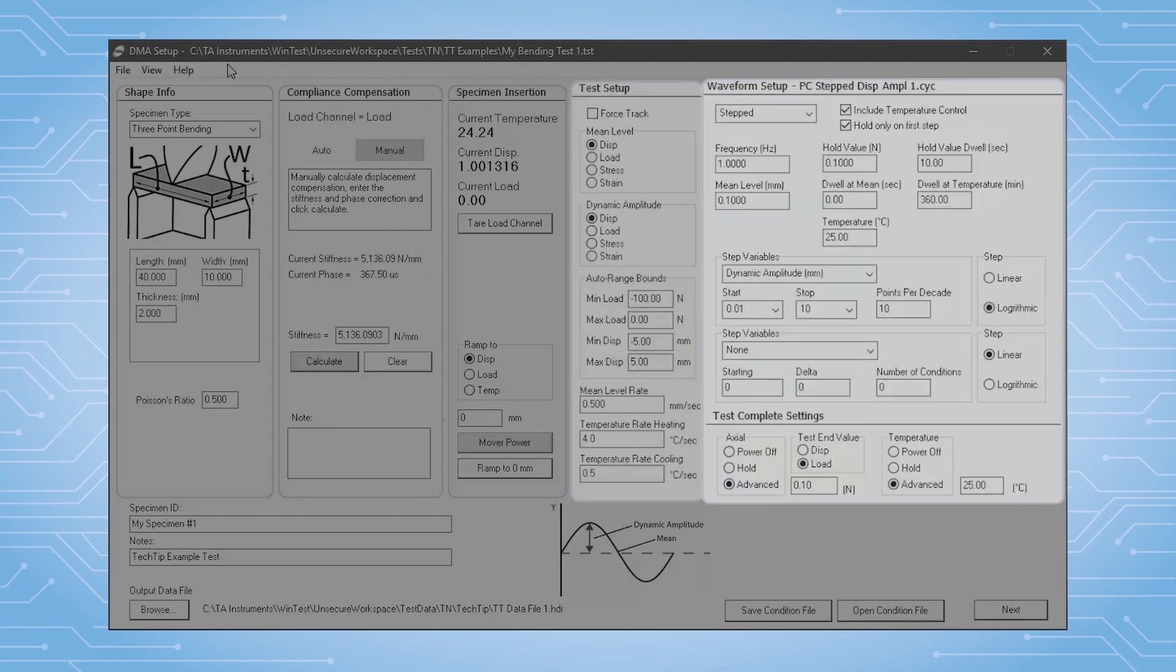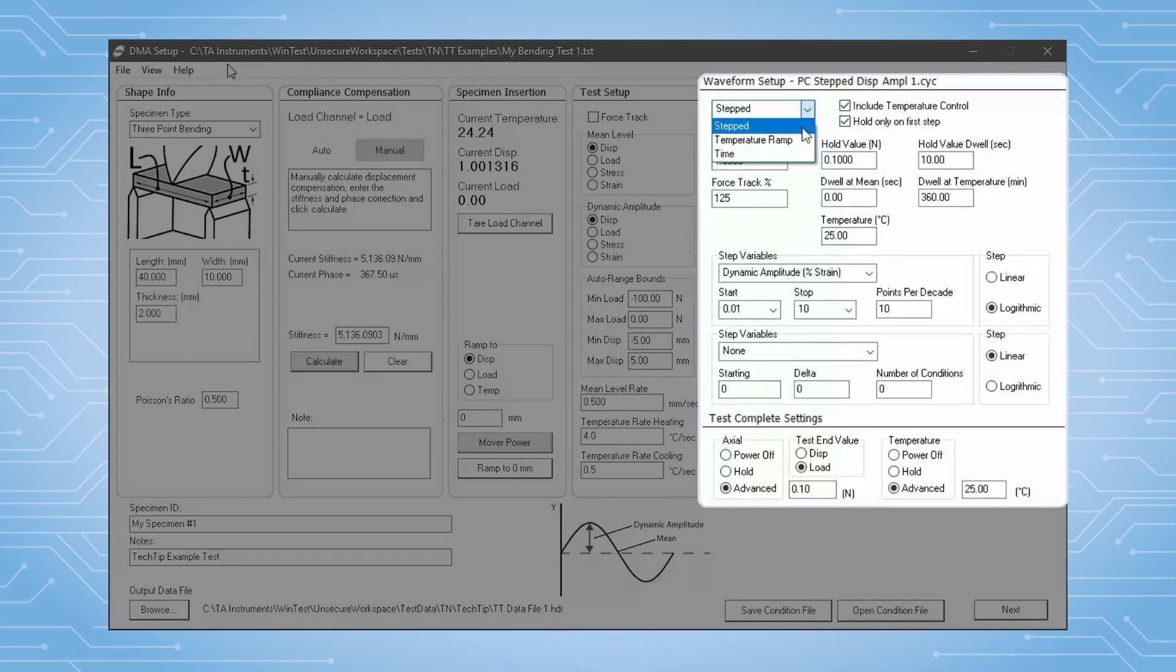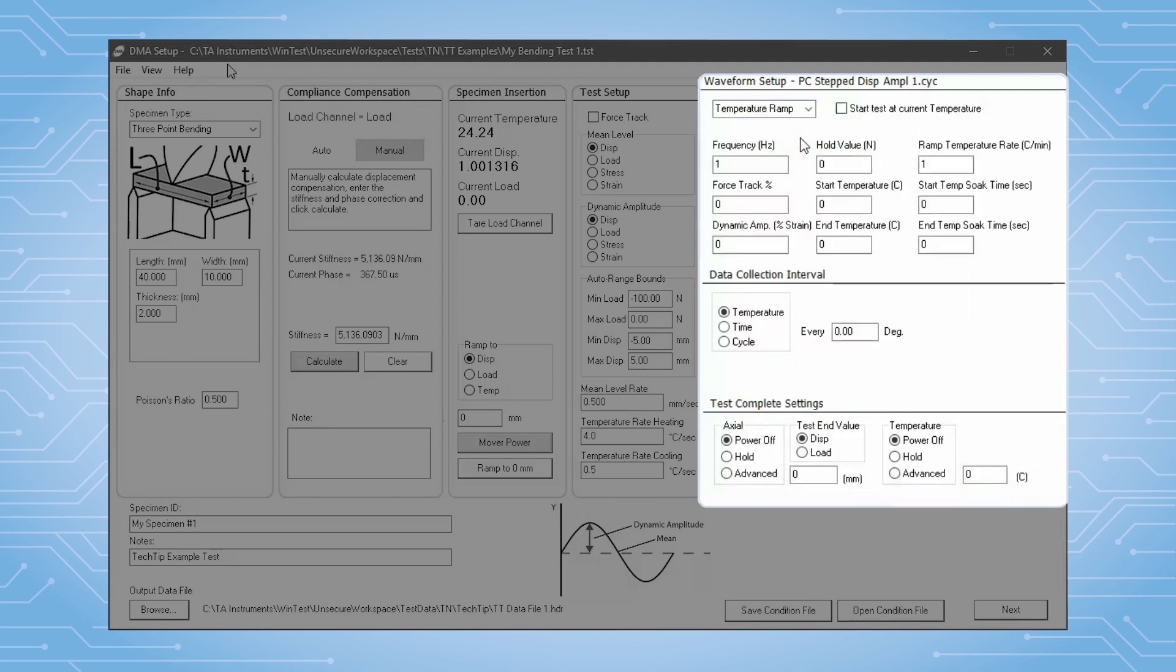We define the DMA test parameters in the waveform setup section. There are three methods available here. These are all oscillating DMA methods: stepped, temperature ramp, and time. Temperature ramp is a method in which we oscillate continuously, acquiring measurements during a constant rate temperature test.